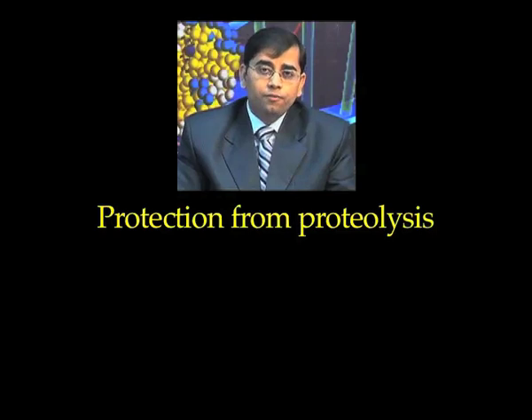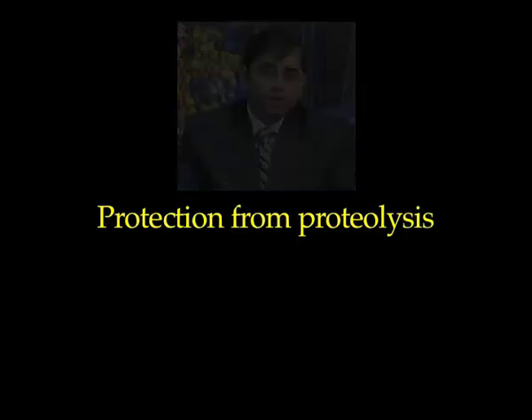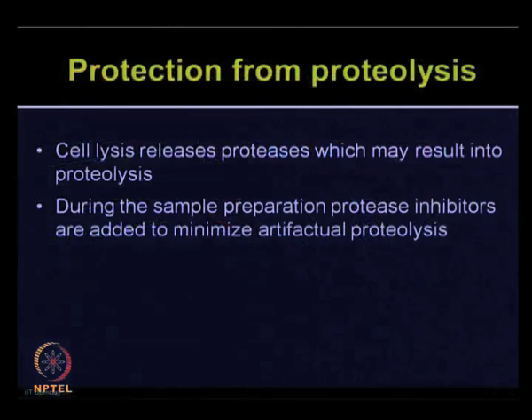So, protection of your protein components from proteolysis is very important during protein sample preparation. Cell lysis will release various proteases which may result in proteolysis. During sample preparation, one can use different types of protease inhibitors which can minimize artifactual proteolysis.